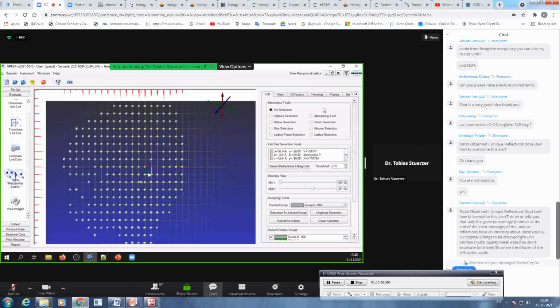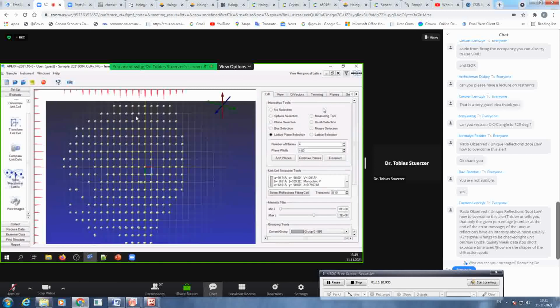things wrong there. Let's say you find something like, let me create something artificial. Like this.